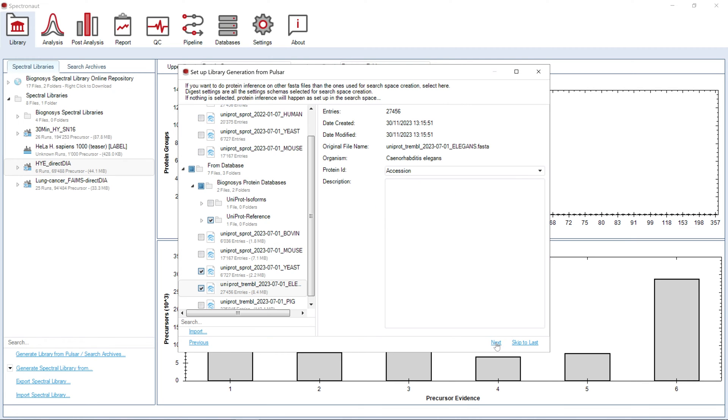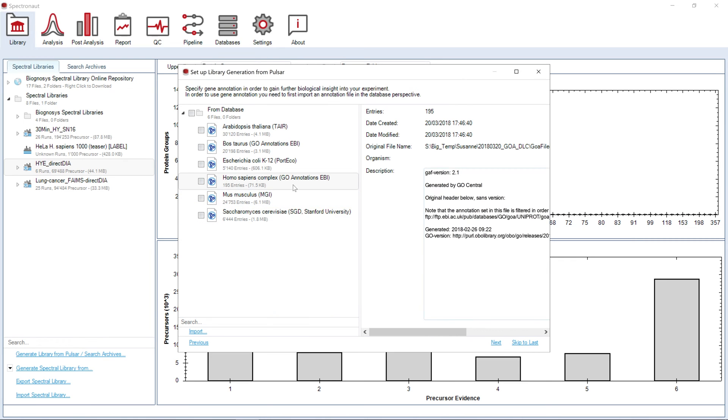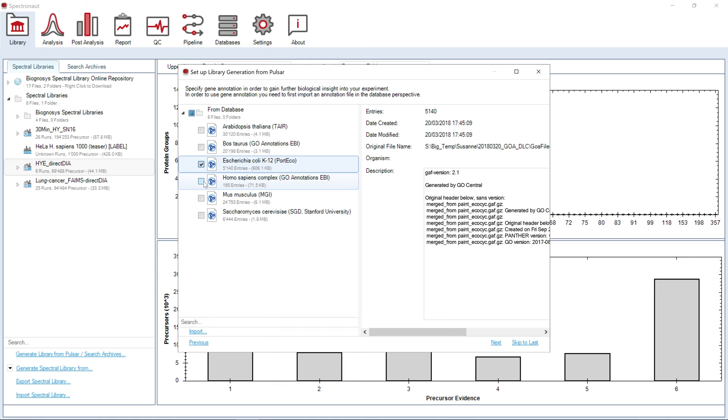In the next step, we will select a FASTA file that will be used for protein inference from identified peptide sequences. Here you can select GEO annotations to further annotate data from your library.